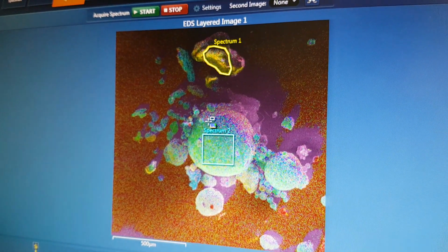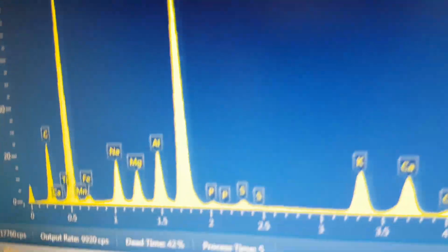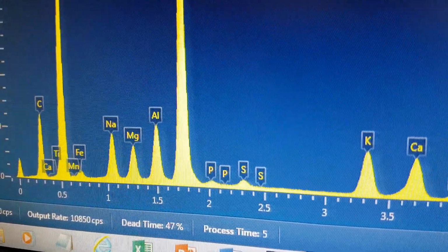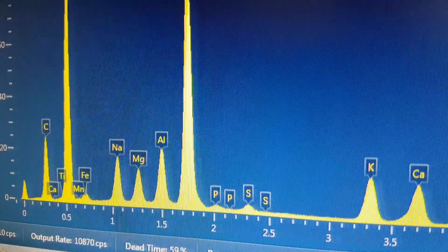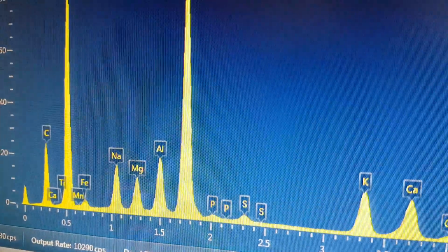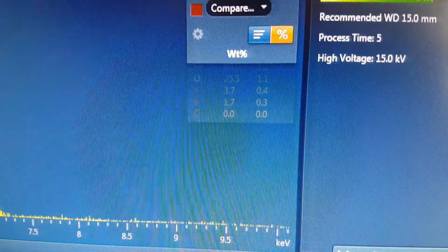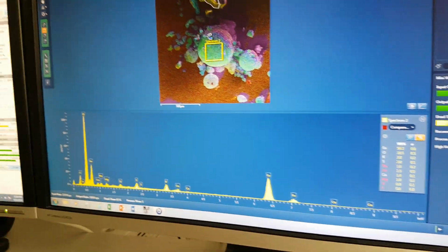Of course there is wood in here, so we can expect maybe to see some phosphorus. Anyway, Egely said that he'd never really seen the phosphorus, and it's not surprising because it would probably go, but we do seem to be seeing phosphorus, which gives us the full... Oh, we've switched on to looking at the other sample area. Let's see what that is.